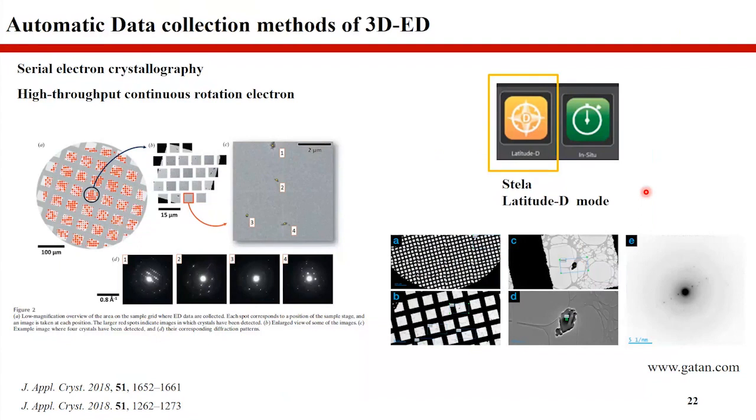I could just say that we are looking forward to this software in the future, because the automatic cRED method could alleviate the burdens for the researchers so that we can focus more time on the analysis.